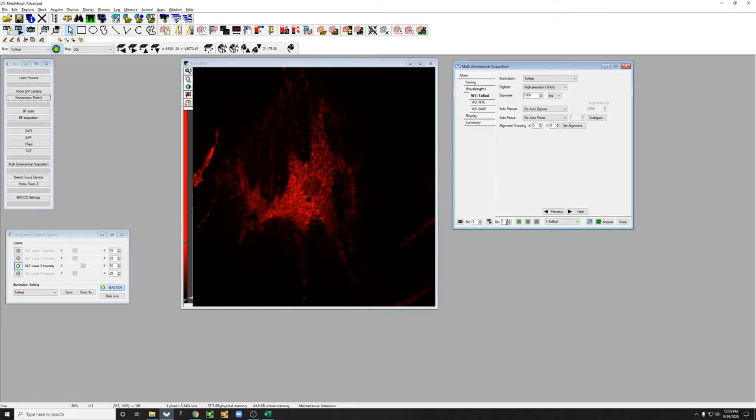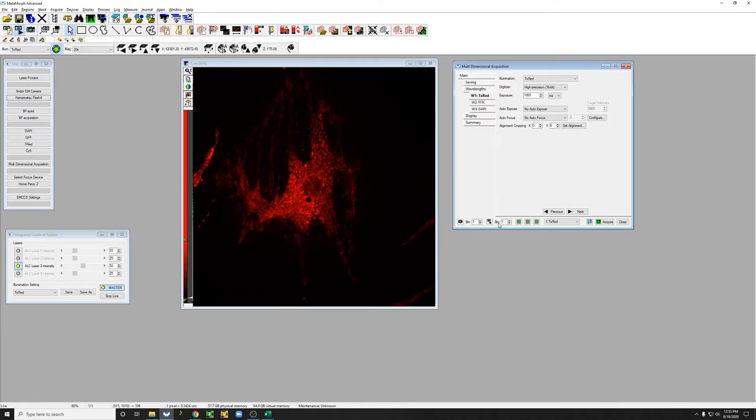So if I have one sensitive element on the camera, that means I translate it to 1 pixel. However, if I increase this number, multiple pixels get bunched together, losing resolution but gaining sensitivity. So let me show you what this looks like.